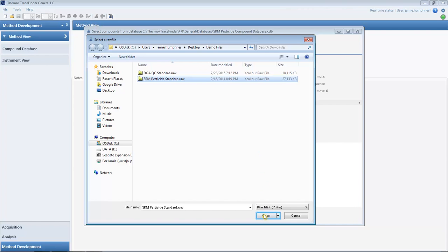This adds retention times, ion ratios, scan filters, and peak shape information. Finally, press add selected compounds to the method and associate the raw file.